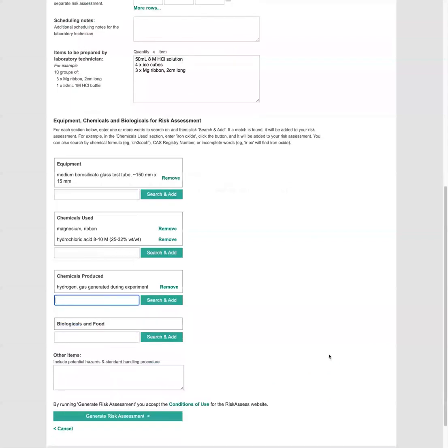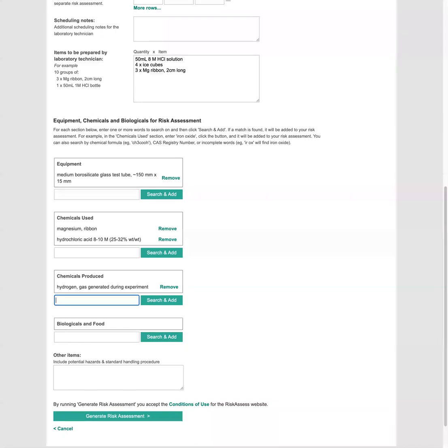So we can go ahead and generate the risk assessment. If there were any other items here that were not in the databases in risk assess, we could enter them here too. But you should pretty much find everything you need.